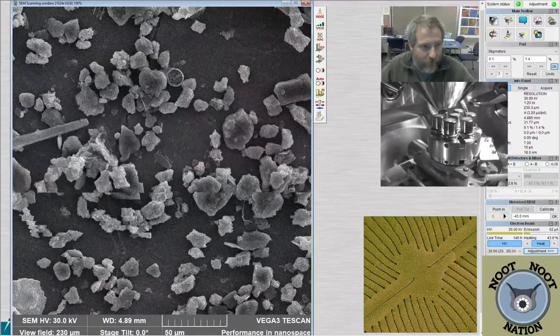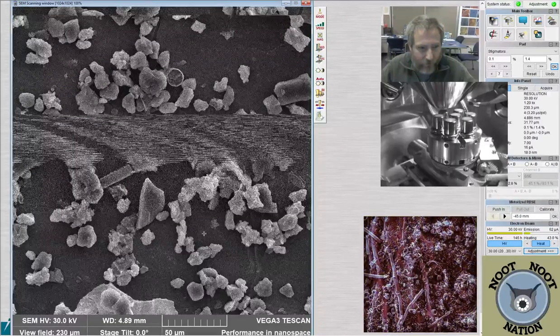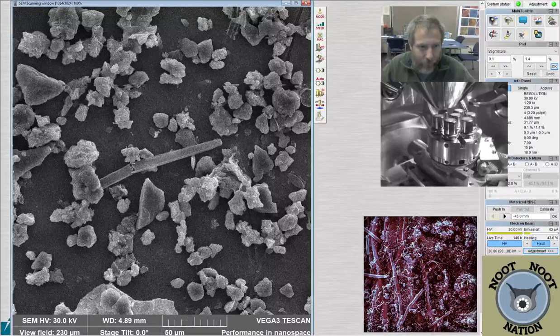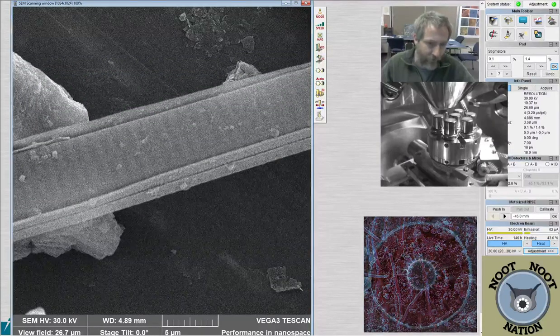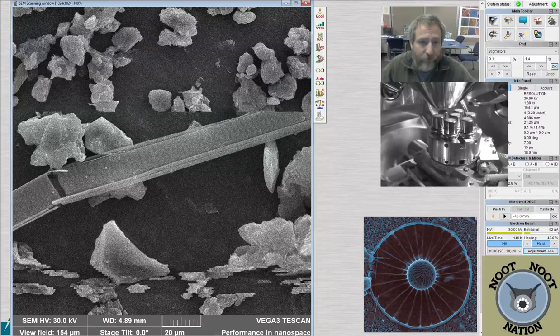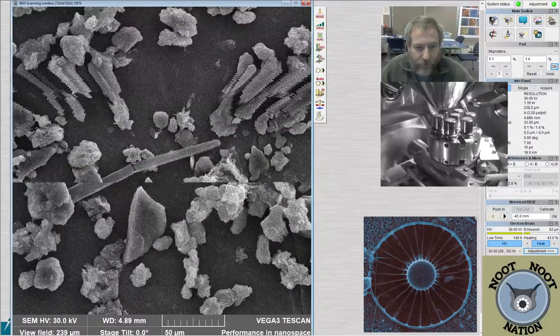There's another Nitzschia over here. We can zoom over and look at it. It looks like it's a fragment. Yeah, it's broken. But that's a Nitzschia as well. Oh no, it's not a Nitzschia, it's a Fragilaria. You can see Ulnaria. Yeah, a broken Ulnaria. Don't know which species.